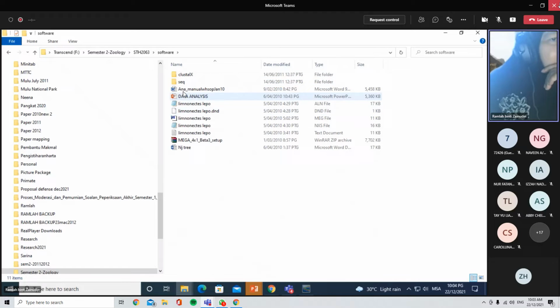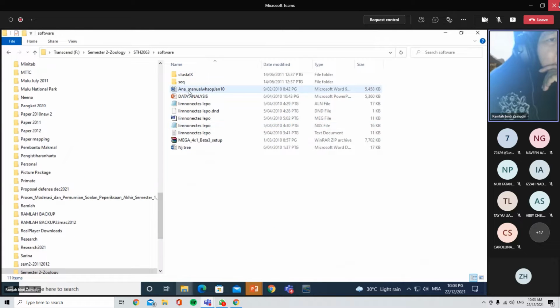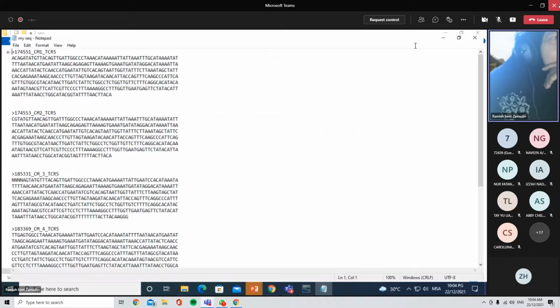Yeah, this one. Okay, so this is how you convert. So kalau nak tengok dia punya, let's say yang the FASTA format, that's fine. This is FASTA format. Kita tengok dalam message kepada dia. So ini dia punya sequence lah.